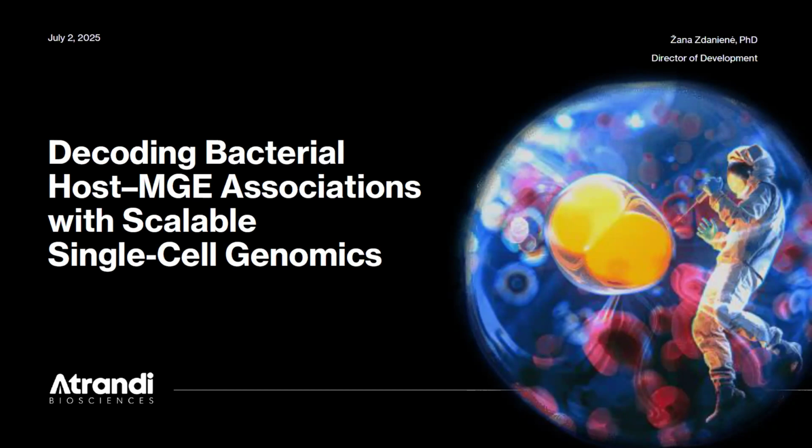So we will start this session with a brief introduction to Atrandi Biosciences single microbe DNA barcoding kit, including the underlying technology, the workflow, and the application to environmental samples. I will be presenting this part, and then I will hand over the virtual stage to Mária, and she will discuss how her lab is using high-throughput single-cell sequencing to study active phage infections and host associations in various ecosystems. So let's start from the workflow overview.